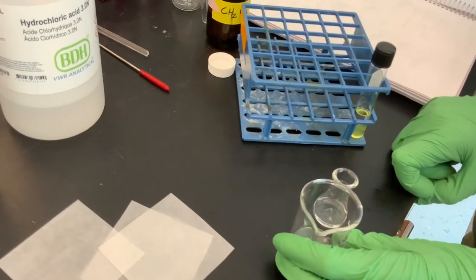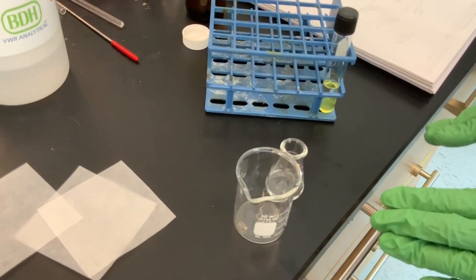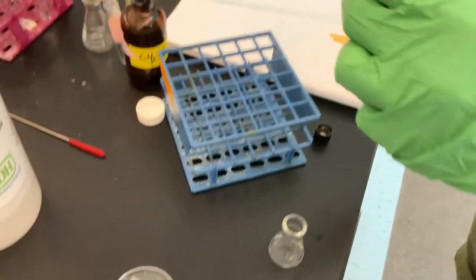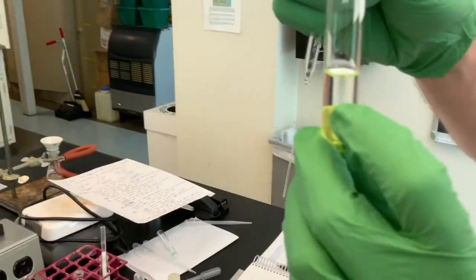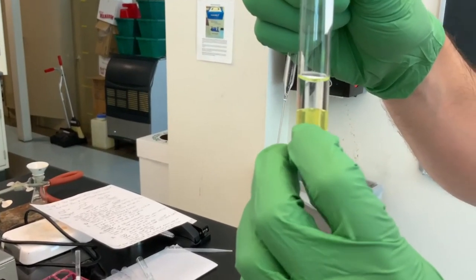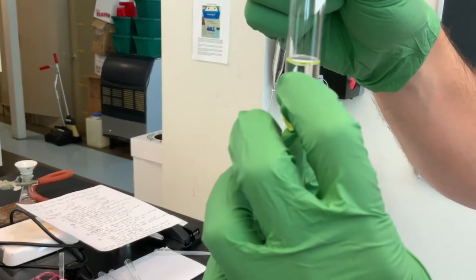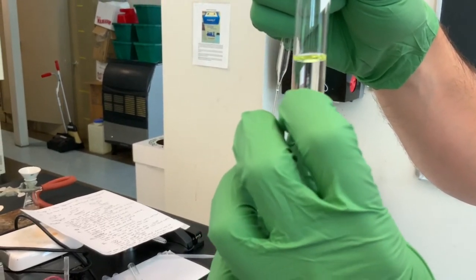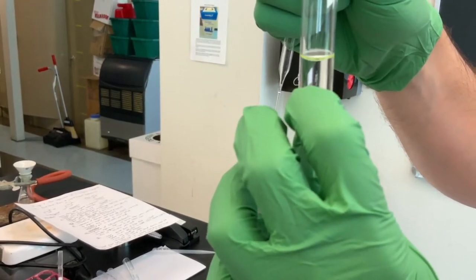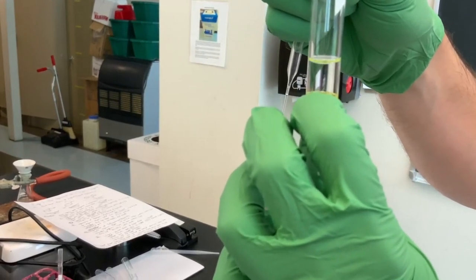We're also going to place it in an ice water bath because we're a little wary of possible hydrolysis. So I'll be right back with some ice. All right, so we gave the culture tube a little time for the layers to separate. Once again, we've got the lower organic layer, methylene chloride, which has the 9-fluorenone and benzoic acid, and the upper 3-molar hydrochloric acid aqueous layer should have our protonated benzocaine, okay? Remember that under these acidic conditions, benzoic acid still remains protonated as its native carboxylic acid. So as a result, it's still more soluble in methylene chloride at this moment.